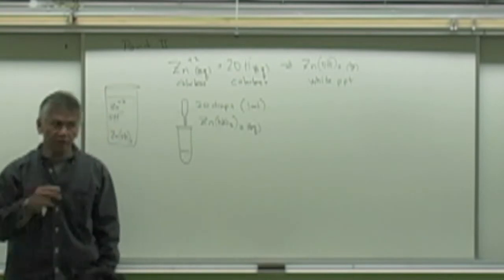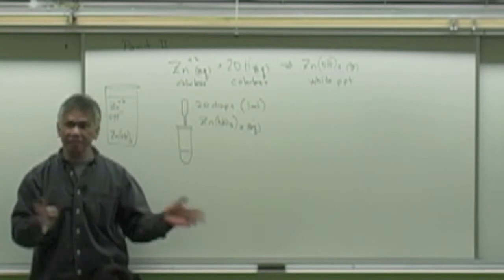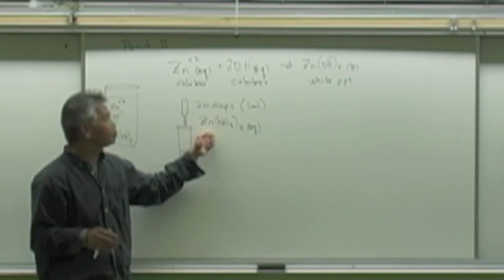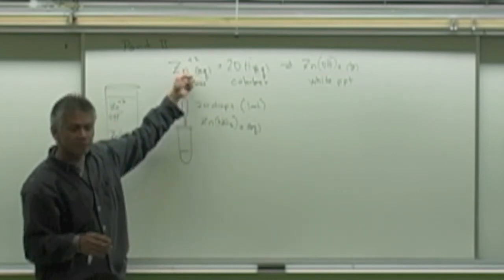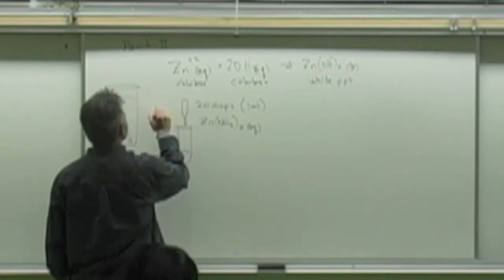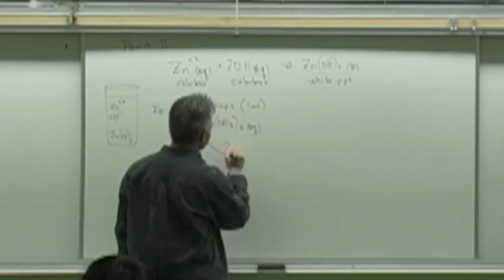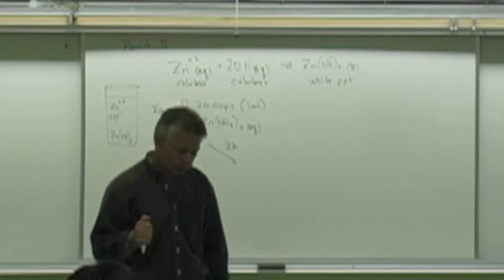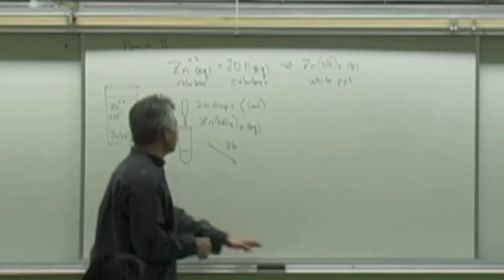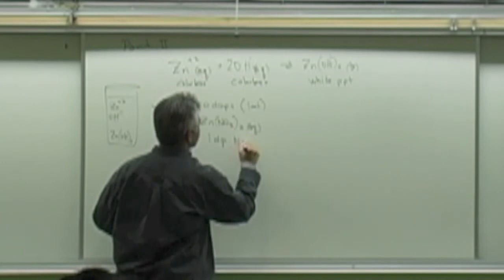Now the nitrate, if you guys remember from chapter 6 or stoichiometry, is going to be a spectator ion. It's not going to be involved in this equilibrium. You only want the zinc from this chemical. You want it to come out as zinc ions. Okay? So that's the first thing that you will do. That's procedure 2A. To the zinc nitrate solution, sorry, I jumped the gun, you also add 1 drop of sodium hydroxide.